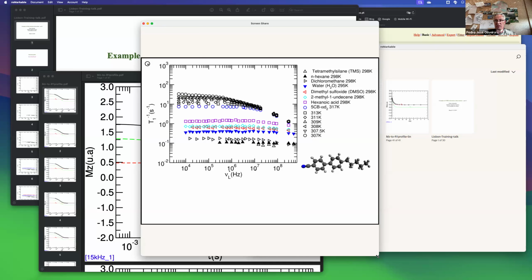If I move to the next one, I change the phase. The material is no longer in an isotropic phase. It's still a fluid, but the molecules at this temperature show an alignment. They align themselves. If I represent them like this, they will show a common alignment along one direction, which I call the director.